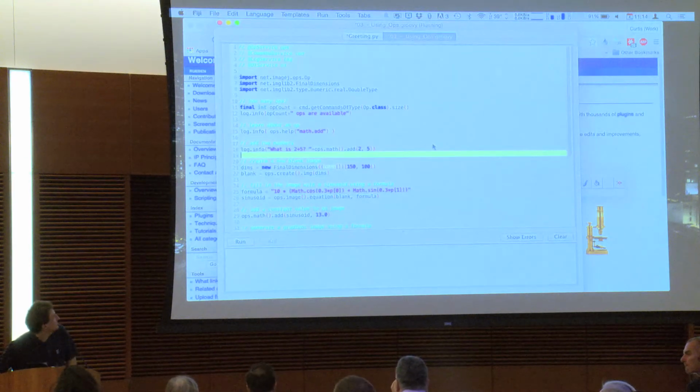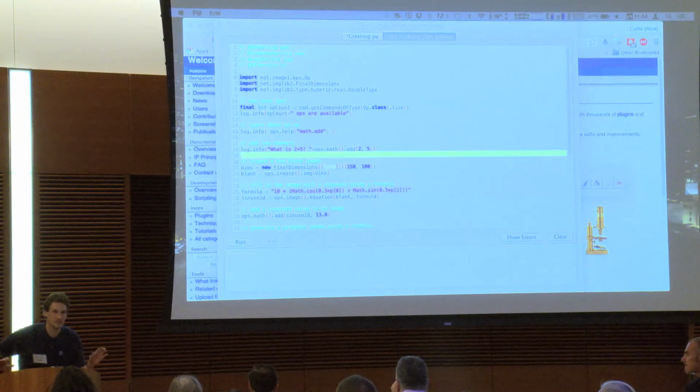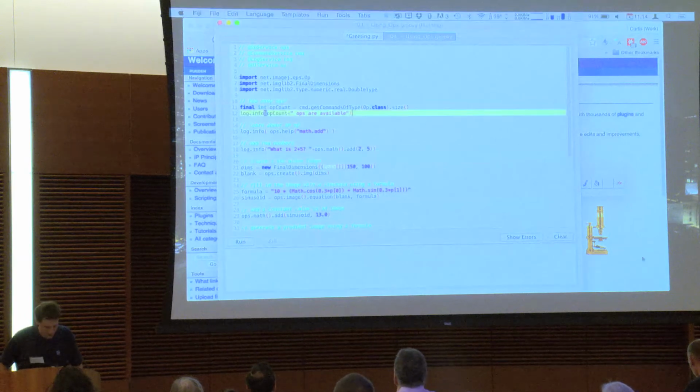And I'm sorry that things aren't more fleshed out documentation-wise, but that's just the reality. I still wanted to show it to people because I'm really excited about it. I think it's the future, and I would like to see more people creating ops as well. So just to show you how powerful the paradigm can be. There is one other way.